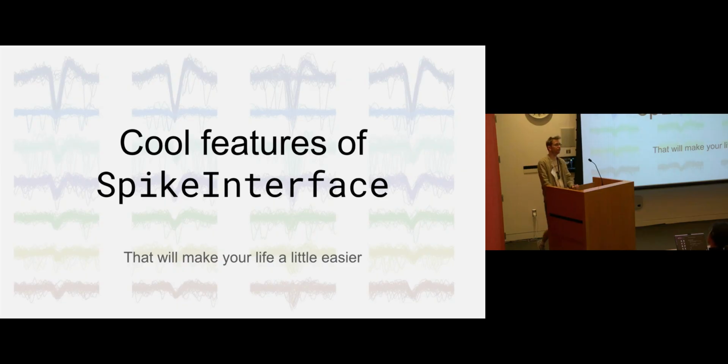Yep. So in our lab, we run Kilosort 4 on a GPU through SpikeInterface. Otherwise it'll run on your CPU. And Kilosort 4 is pretty fast on a CPU. By fast, I mean an 8-core CPU will do an hour of Kilosort 4 NeuroPixel in 8 hours. That's overnight. That's pretty fast. And CPUs are cheap. I think it's actually more cost-effective to run Kilosort 4 on a CPU than a GPU if you're doing Amazon cloud services.